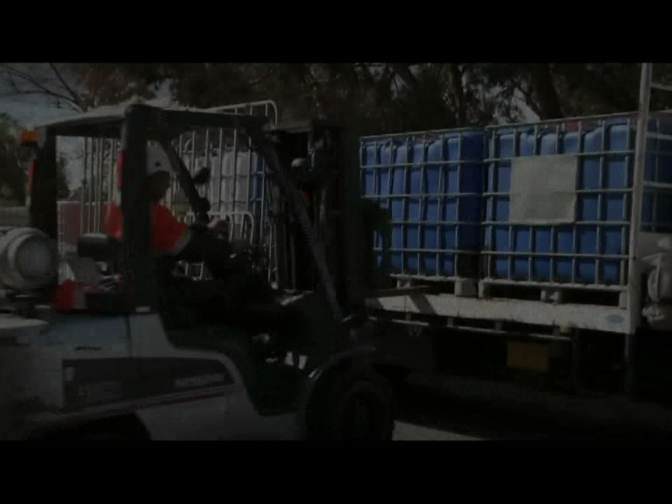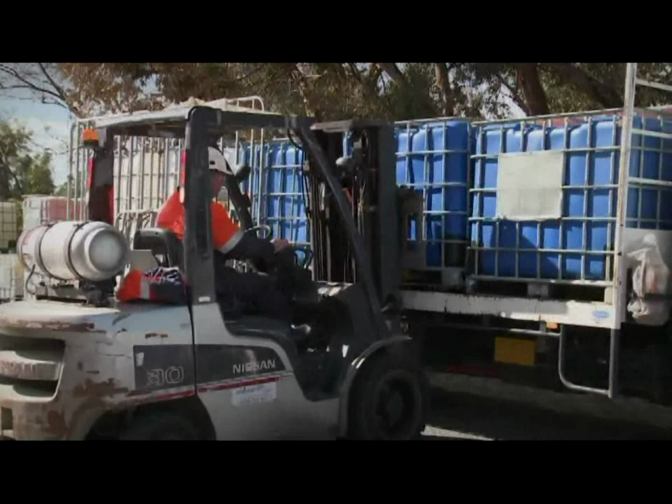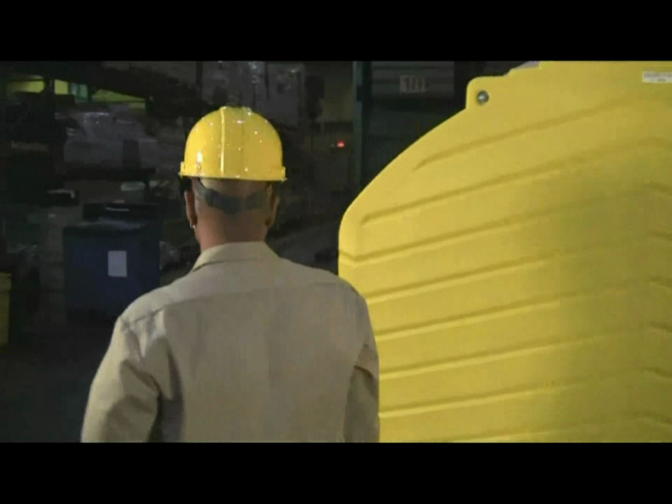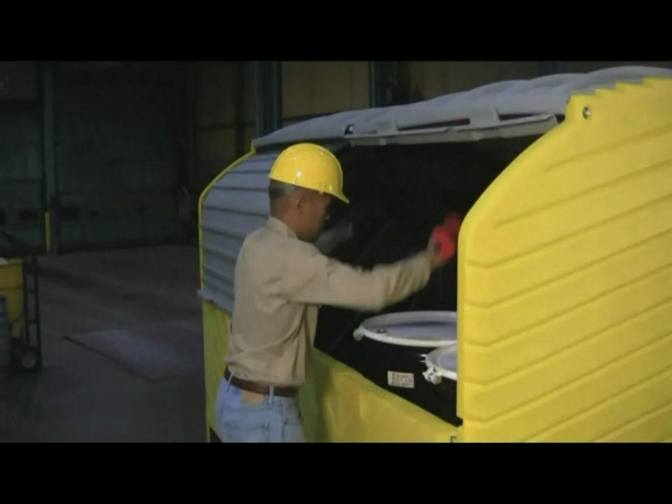Therefore, you should keep the material away from heat. Handle containers with extreme care. Do not drop or shake the chemicals. Check the date on the containers. Store the material in a cool, flame-proof area as designated by your immediate supervisor.